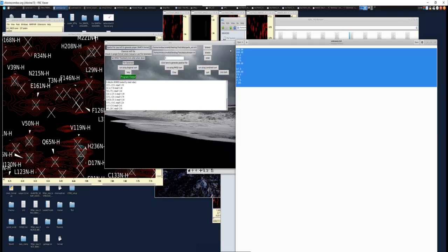So ideally, you would always want to use Sparta Plus, but if you can't, then this BMRB is better than nothing. And as you can see, if you have 3 or 4 amino acids in a row, you can use it identical to Sparta Plus. It's just as effective. So this is how you can use this APS program to use these Sparta Plus values or just the BMRB values to assist in assigning your protein.